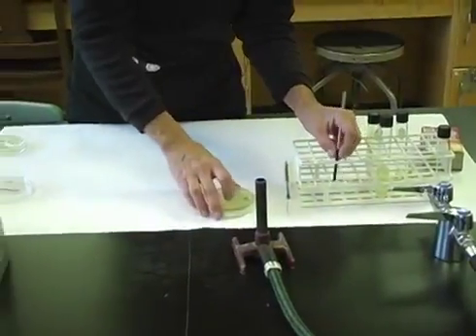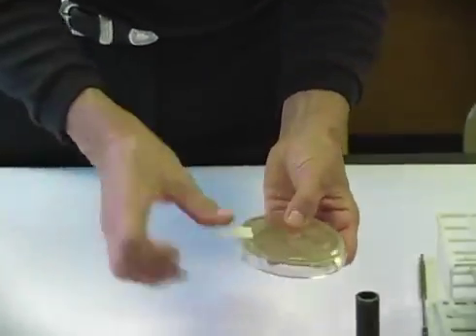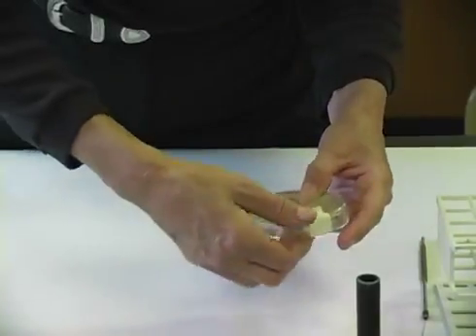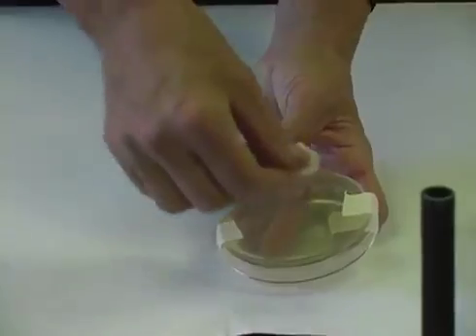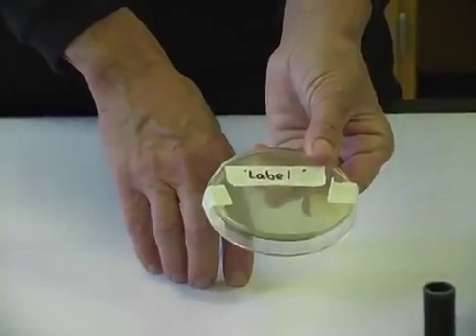I'll tape my petri dish, the lid to the bottom. I'll make sure that my label goes on the bottom of the plate, and I will then place my plate inverted or upside down in the incubator.